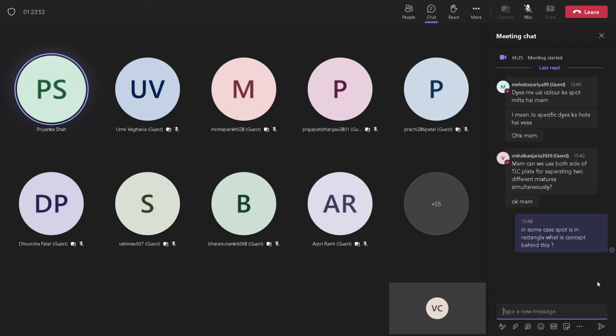If at 0.67 you are matching in the library, there is one compound, suppose tryptophan, one kind of amino acid, at 0.67 retardation factor. So the library has given an initial answer.